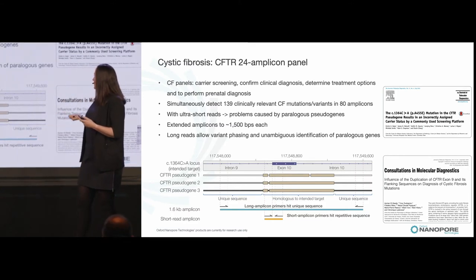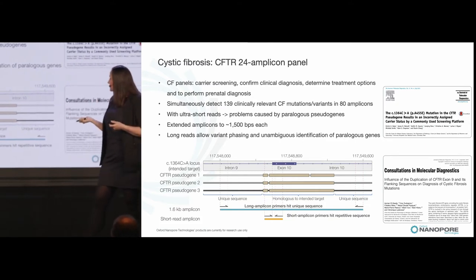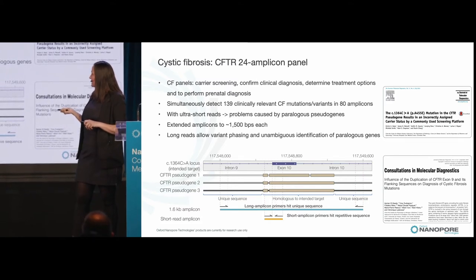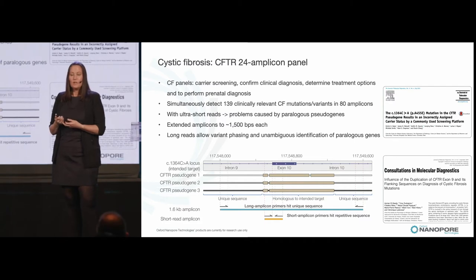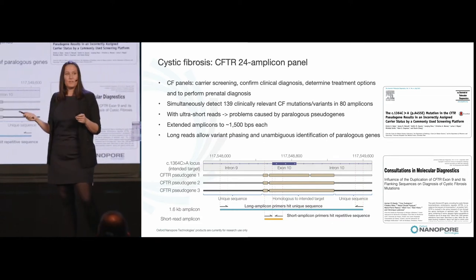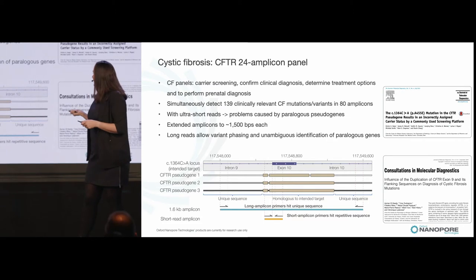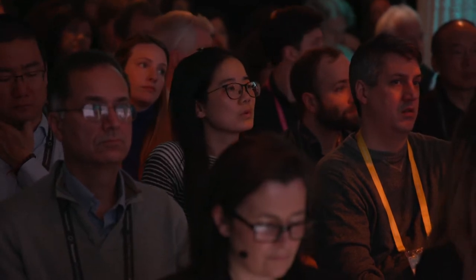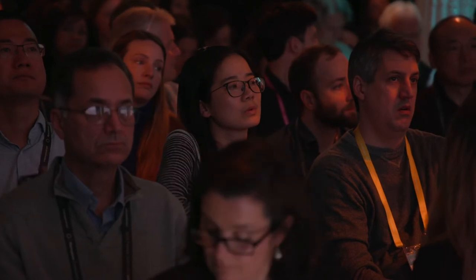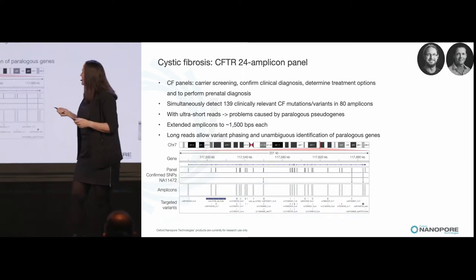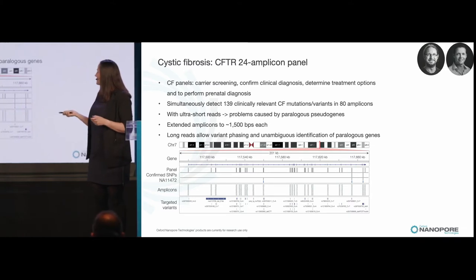What we've known, and what's been shown many times in literature, is that when you have these ultra-short reads, you end up having trouble with paralogous pseudogenes. In this specific example, around exon 10, the reads also map to three different pseudogenes, which muddies the results. So what we did is expand all the amplicons to 1,500 bases instead of the ultra-short reads, so we're then able to map uniquely to the parts of the genome. Instead of 80 amplicons, we have 24. We tried this on a sample with known SNPs, multiplexed the PCR in one reaction, and ran it on a MinION.